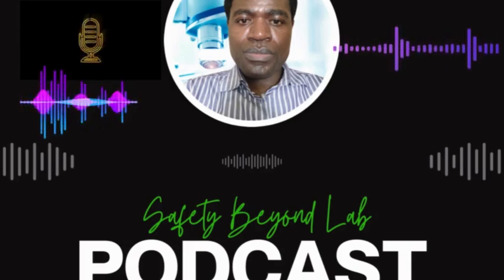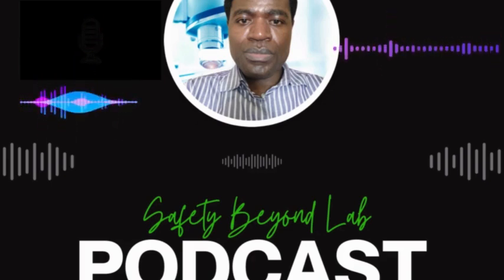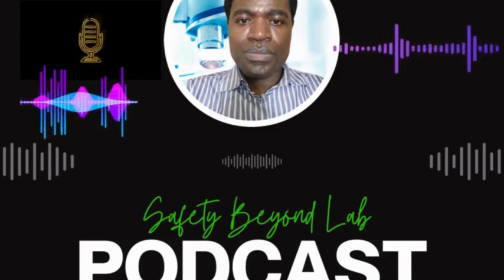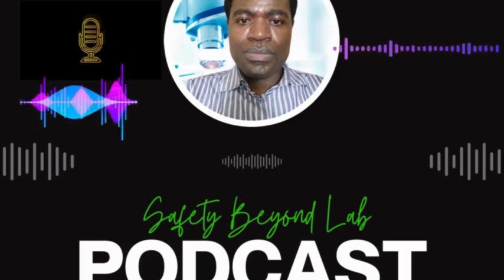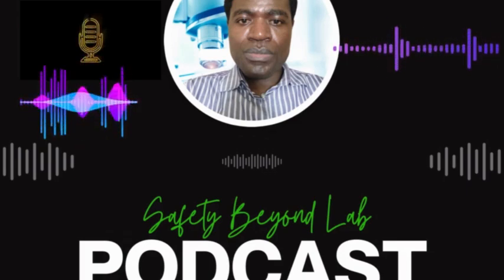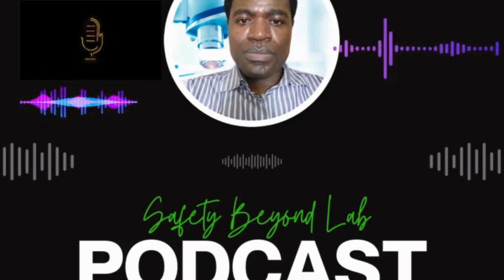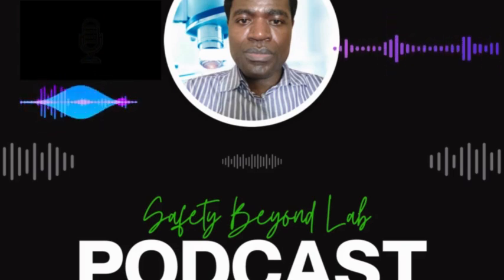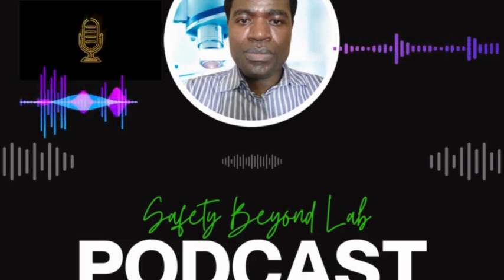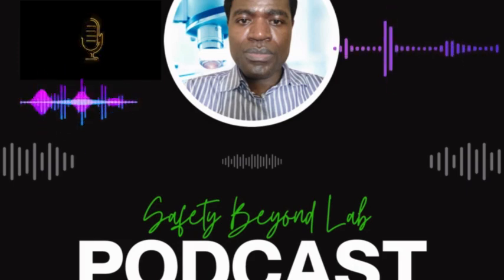Today we are exploring a critical topic for anyone working in or around laboratories: laboratory acquired infections, or LAIs for short. Whether you are a seasoned lab technician, a student, or just curious about science safety, this episode is tailored for you. We'll cover what laboratory acquired infections are, how they occur, notable cases, and most importantly, how to prevent them.